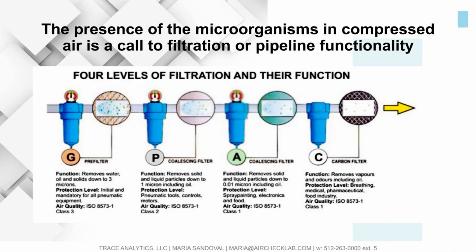And so the next question that always pops up, and I want to kind of stay here for a little bit, is that the presence of microorganisms in compressed air is asking you to go investigate your filtration or your pipeline functionality. And what I mean by that is oftentimes you guys get stopped right at having microorganisms in your compressed air and you don't know what to do. And so I wanted to take a little bit of time here and talk about that.